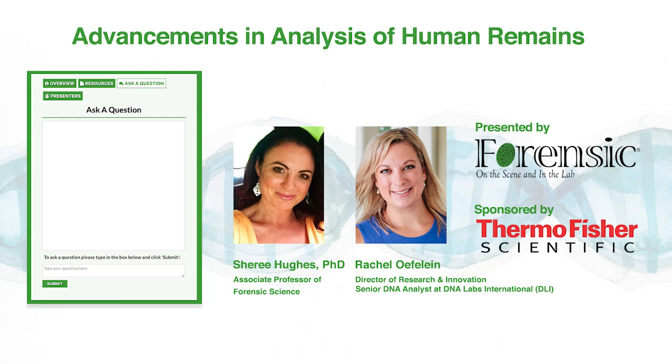I would say it's an incredibly challenging sample, but if there are any fragments remaining, that's definitely always something that you could look at. I would not recommend that for rapid. It would be something that you would want to go a more sensitive route, like a demineralization, to try to maximize any DNA that can be obtained.